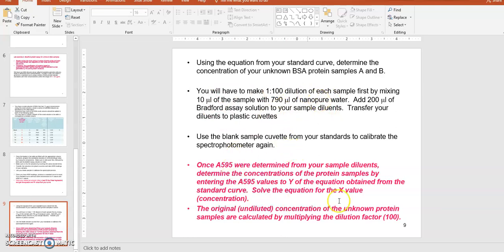Okay, so that part should be done. Based on this, you will be writing lab report 3. Lab report 3 is about protein concentration only. DNA, RNA, you can include that if you want to. The main part is the protein concentration with the standard curve, best fit line, trend line, and R-square value and equation. And then based on that, your estimated concentrations of BSA unknown A and B samples will be your main data. We're going to talk about that during the face-to-face lab as well.